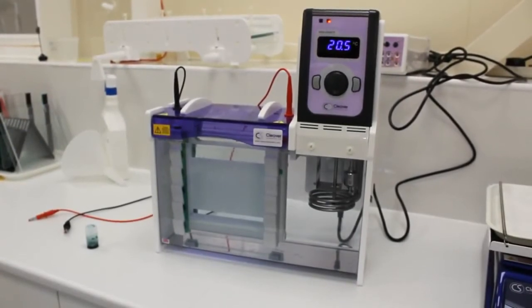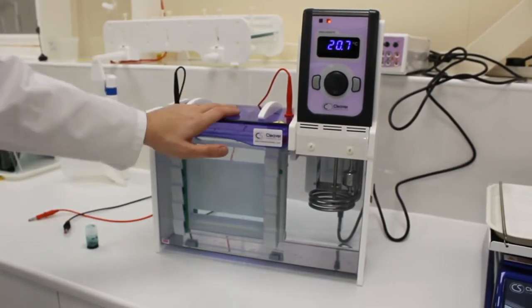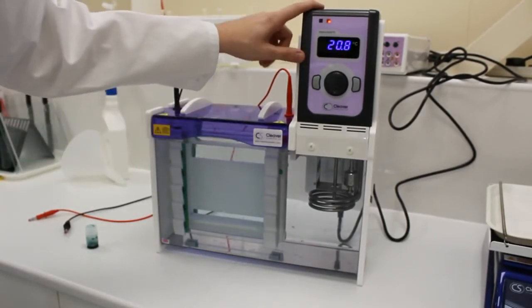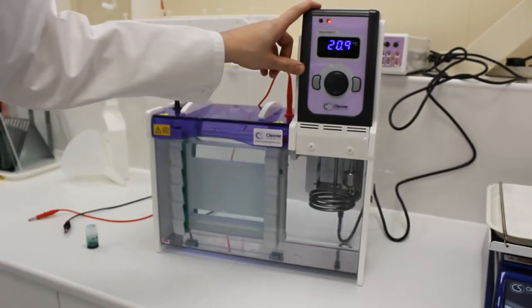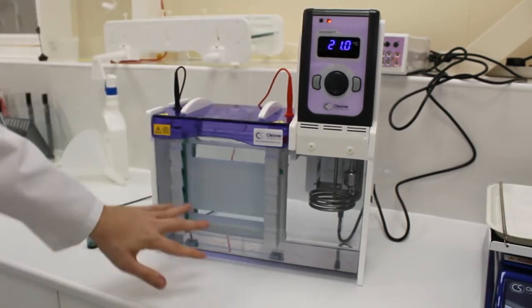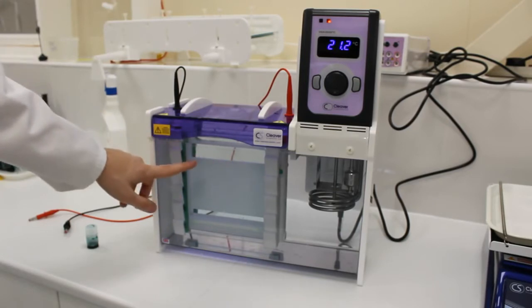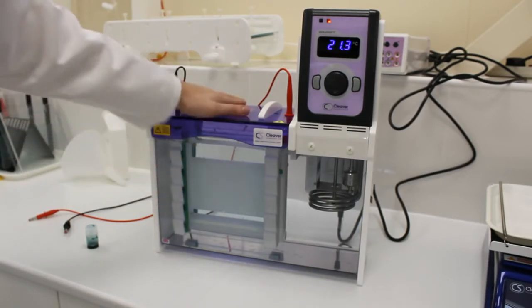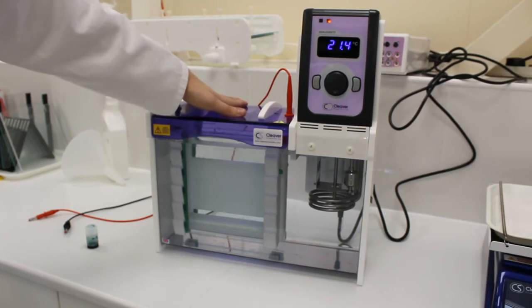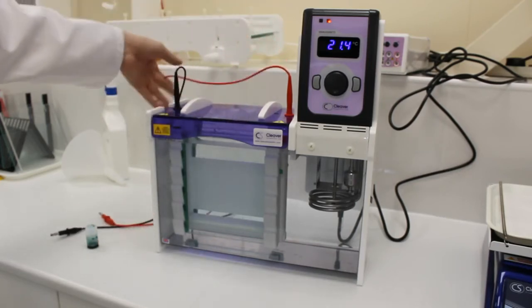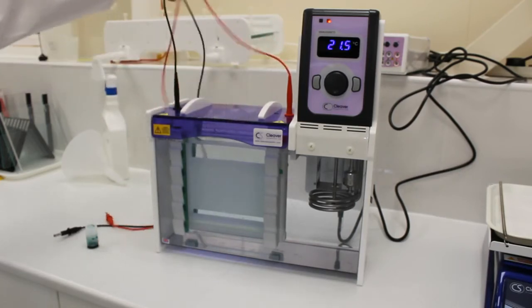So we've moved our gels into the tank and put the lid on and we're now preheating the buffer to 60 degrees. We're preheating the buffer and all the gels, and we've taken the combs out of the gel so we've got a well formation here. Once we've preheated to 60 degrees we'll load our samples and connect to the power supply using the electrode cables and start the run.